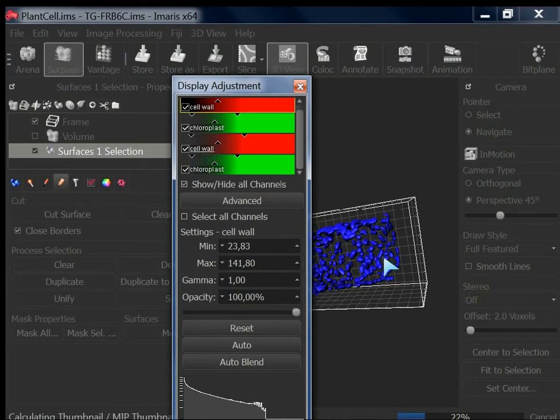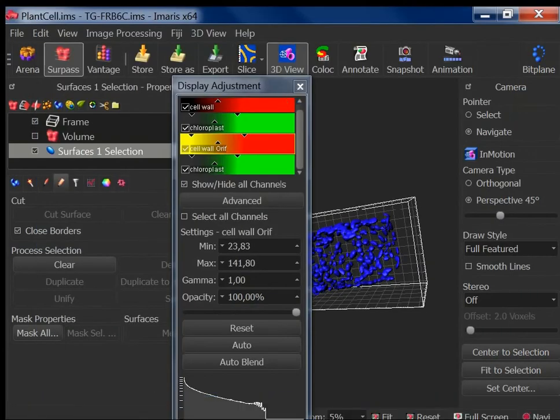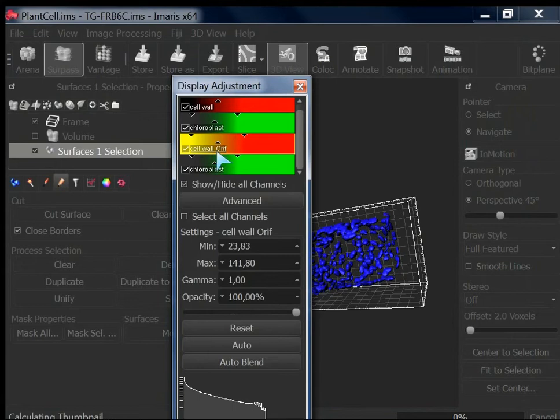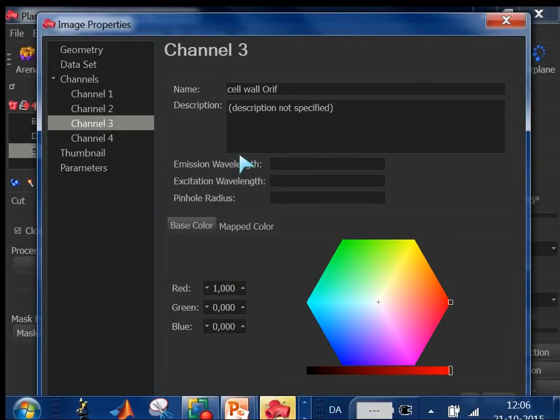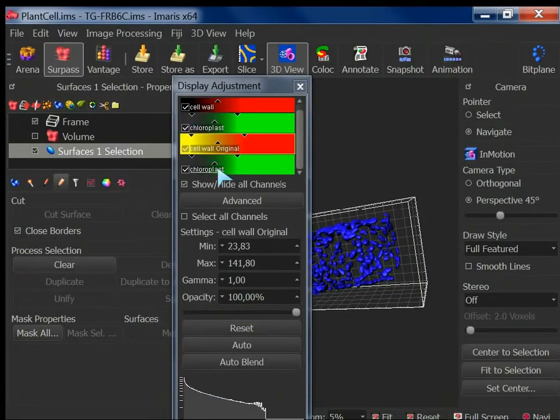This is very time consuming. I would say original, because it has to compute all the MIP information, because it doesn't know that we are not interested in MIP, but it does it by default. So I would say it's original. Okay. Similarly for the second one, right?